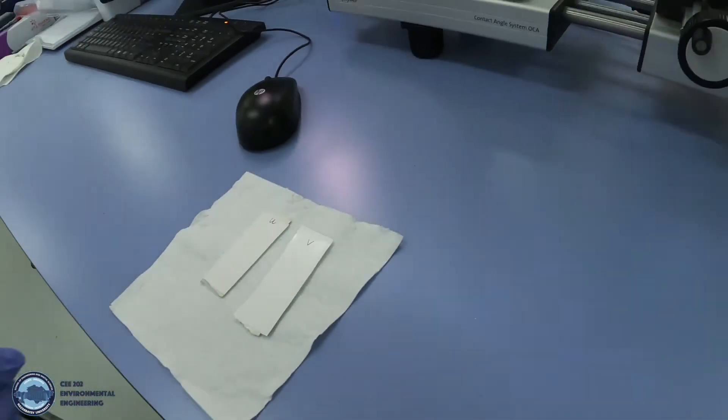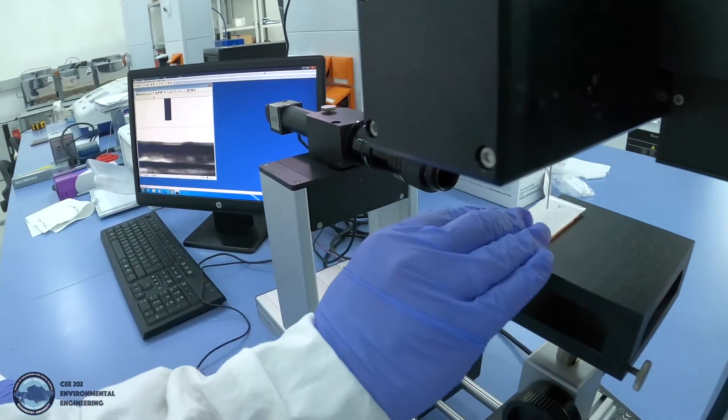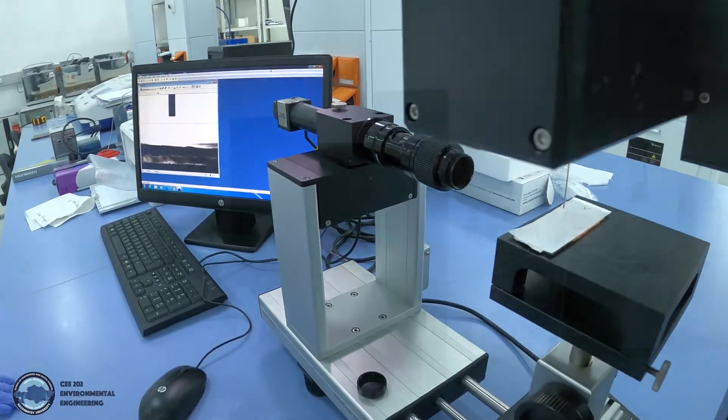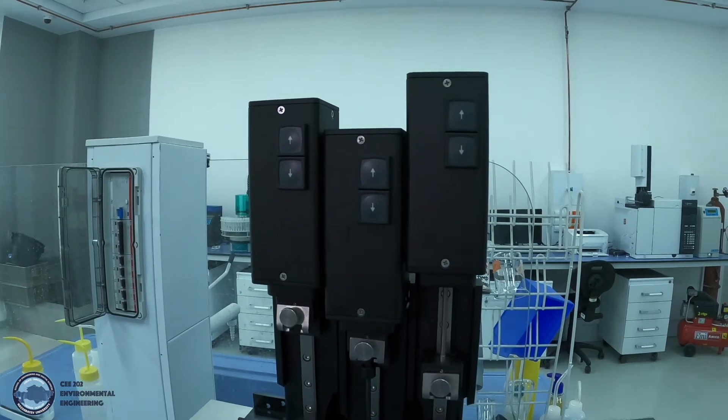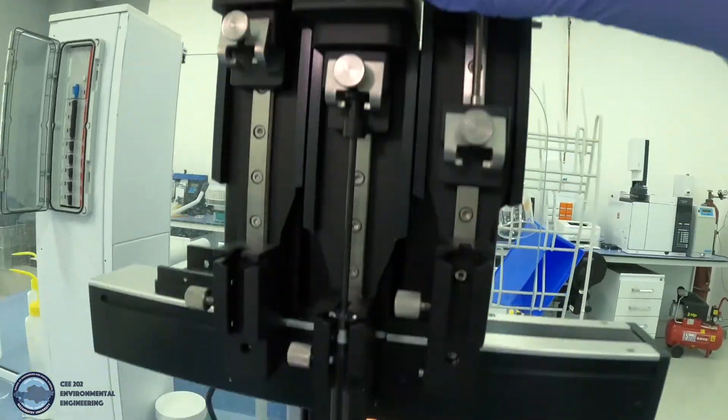After that, we will place our first sample, virgin membrane, on the device's table. Next, on the device we will press button with arrow down symbol and release the water drop.